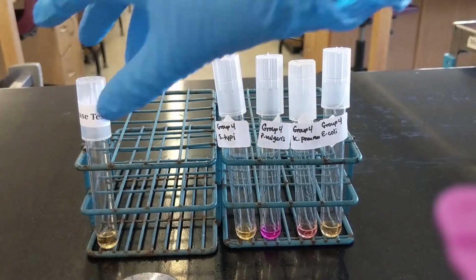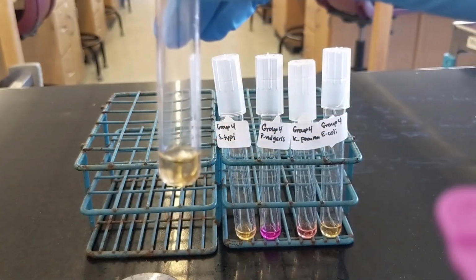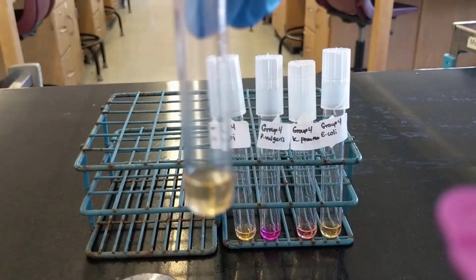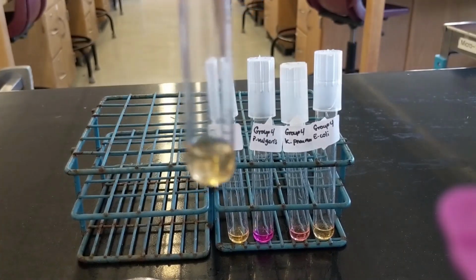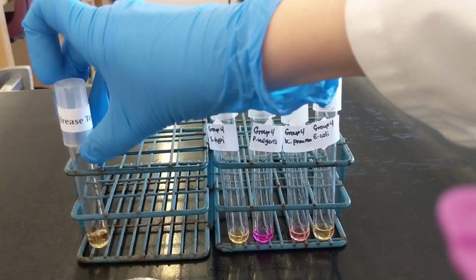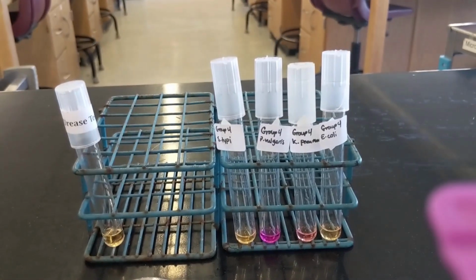So for the urease test, this is our control tube, urease broth, which is more of a yellowish color starting off. It's hard to get it clear. Here, you could tell it's a yellow color. So basically, we want to test the presence of urease, which is an enzyme, and it's detectable through organisms which are grown in urea broth containing a pH indicator, phenol red.